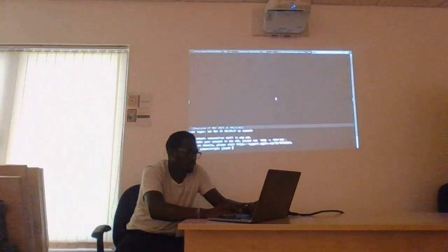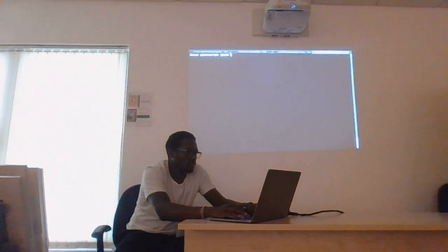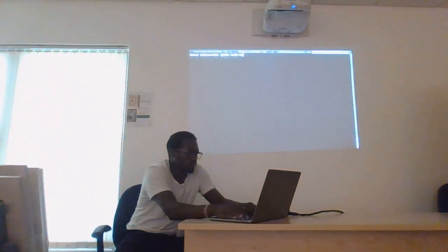Sounds like I don't have it. Maybe we use the RNA-seq one.